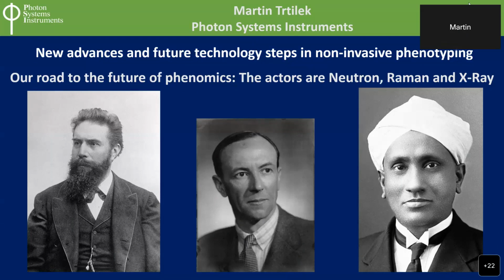So today I would like to talk about the future technologies, new advanced technology, which you may use when you do research and you want to get the Nobel Prize. So when you want to do something special. Basically, I will talk about neutron, Raman spectroscopy, Raman imaging, and X-ray.